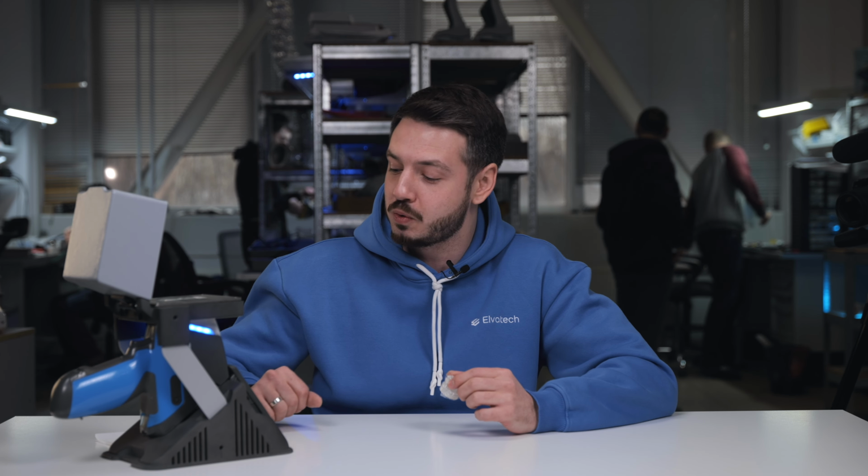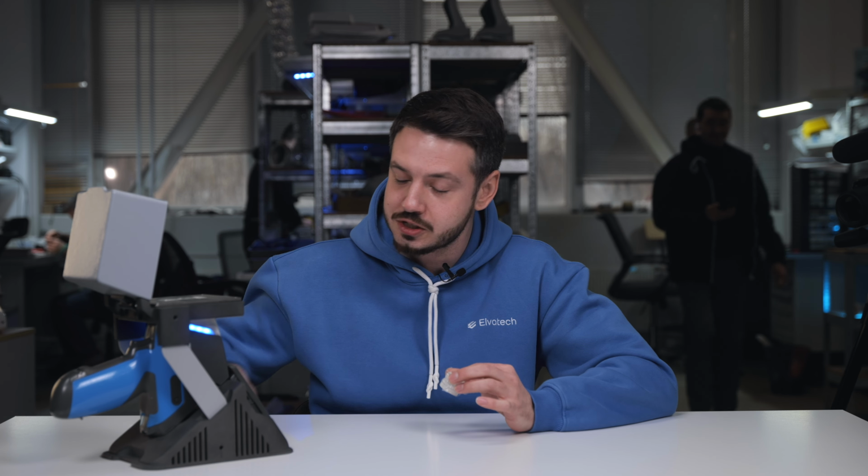And trust me, you definitely don't want it because all repairs in this field are going to be really expensive. So let's move on to our experiment here. And first of all, we need to check safety first.